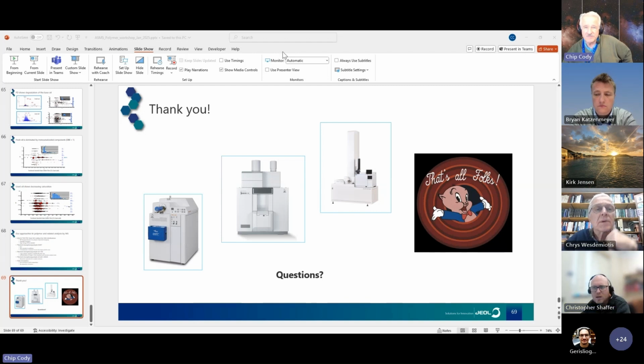No, we didn't. I mean, we're just a mass spec demo lab, so this was an interesting application. Really, I don't know what Kirk was expecting. He may have to leave the meeting early today, but I was expecting to see just the degradation of the additives, but I was also expecting maybe it's some of the materials that got trapped in the pump oil. I guess it was probably from electron microscopes that wouldn't have the level of organics that we would expect from the mass spectrometer. But I guess what's happening to the oil was really interesting. Yeah, it's not aromatic. I think these are actually just polyunsaturated. Yeah, I think so too. And that's what's really interesting to me.